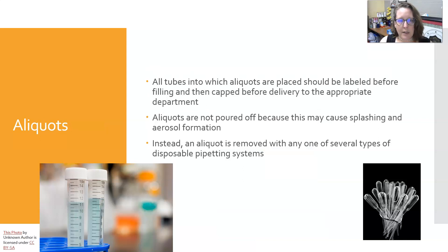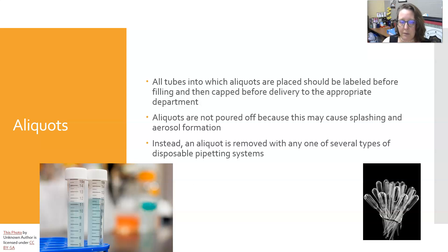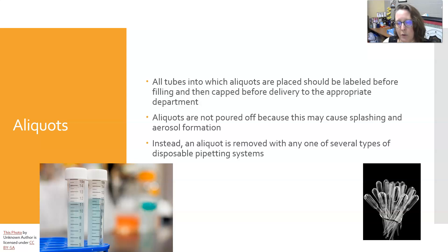All tubes into which aliquots are placed should be labeled before filling and capped before delivery to the appropriate department. It is very important to put the right information and properly label the aliquot, because they become the specimen. Aliquots are usually not poured off because this can cause splashing and aerosol formation; instead, an aliquot is removed using disposable pipetting systems, especially transfer pipettes.